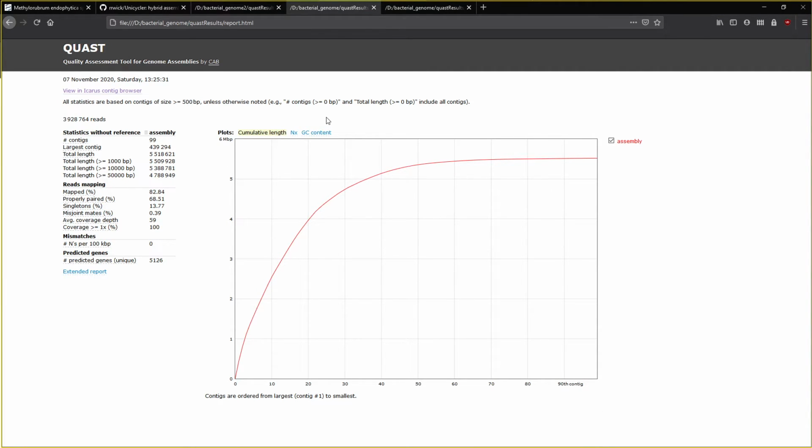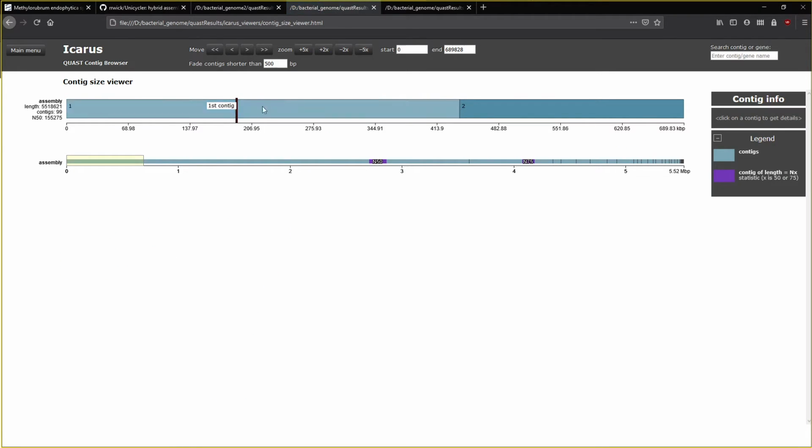So this is using the same assembly pipeline, so trimming and all the way through, except here we have predicted genes. If you go to that Icarus thing, we should be able to, in here, I thought see genes, gene name. No results, so it must not work.